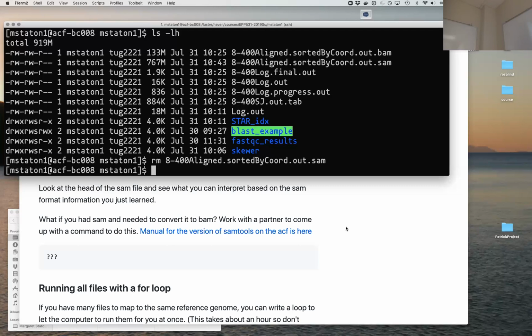Is there a more efficient way? Oh, I wonder if they've made the whole compression algorithm more efficient on samtools, or are they just using an older something. Right. Yeah, there's no way to really interpret what's going on with the BAM file.